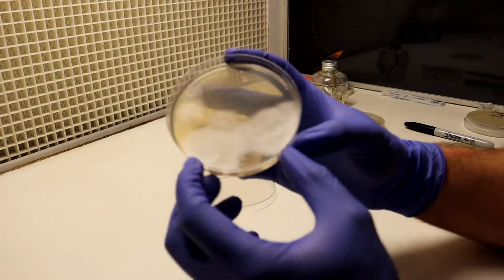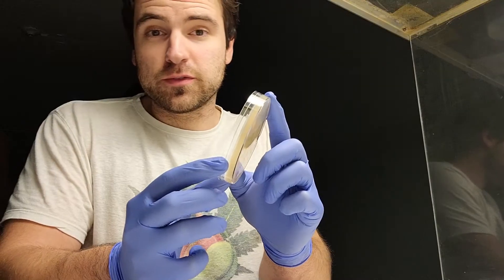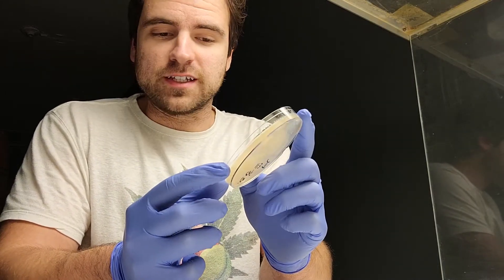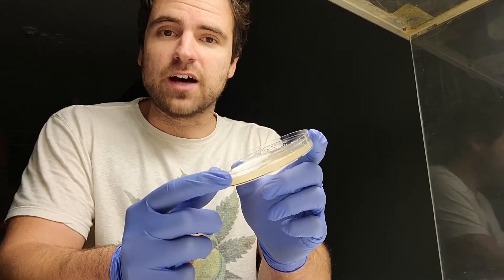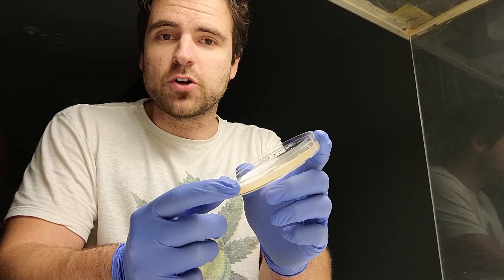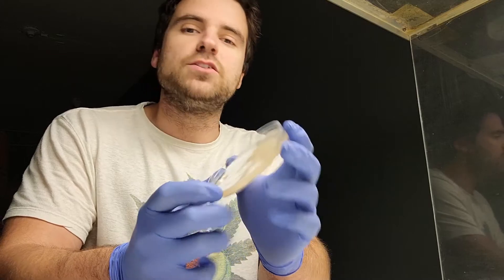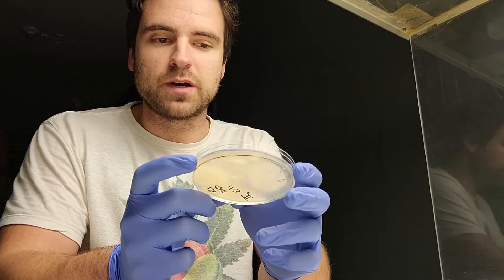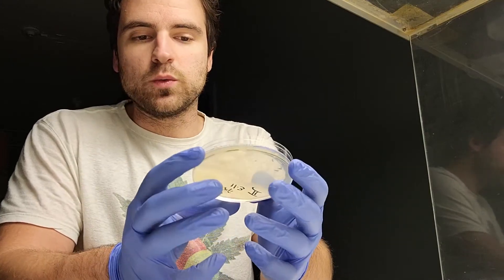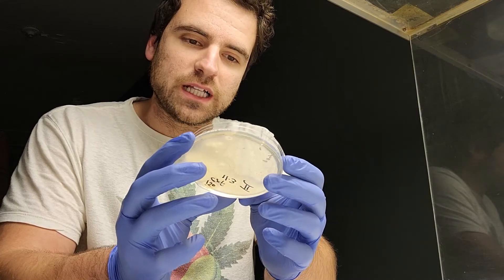I'm not too surprised by how little diversity we saw in these plates. I would have expected a significant amount of bacteria and yeast. We do see something — I can't tell if it's bacteria or yeast. I'd love to look at it under a thousand oil immersion microscope, maybe even do a gram stain if it's bacteria — it's curious. But in this case it doesn't really matter; we just want to clean up our isolate.